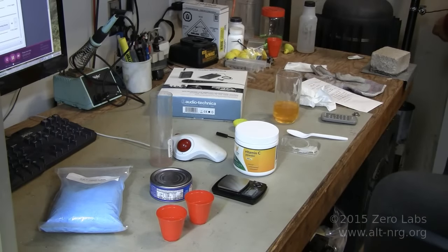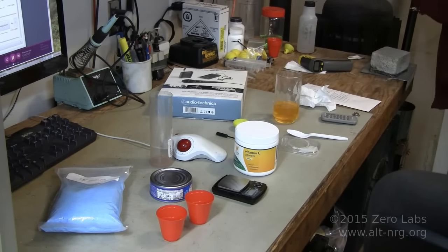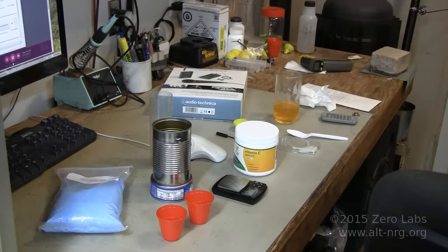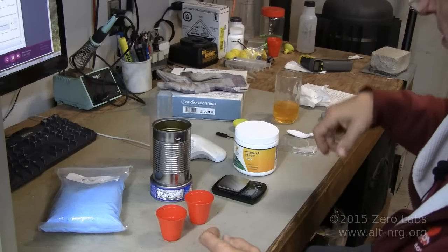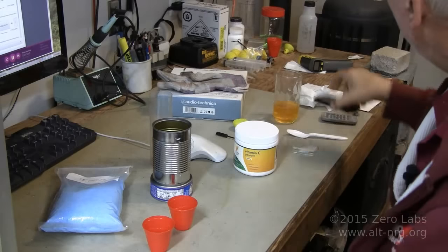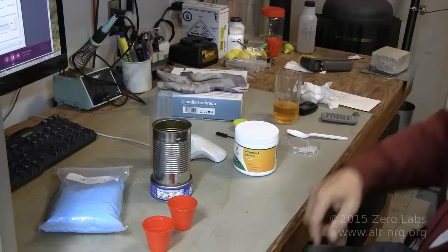It's pretty close. We're up to 184 degrees Fahrenheit, so that's about where I wanted it. It's 84 degrees centigrade. The recipe calls for 70 degrees centigrade water. This is hot enough, so I'm just going to set this can right here. You can see it steaming away. And the first step is to make a saturated solution of ascorbic acid. This, incidentally, I will link to below.